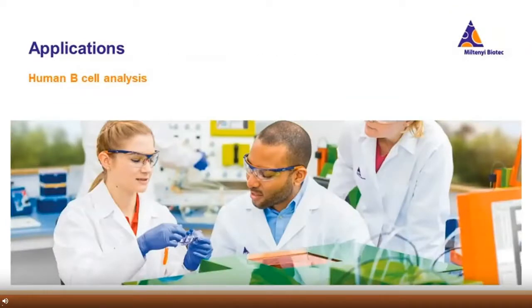Yeah, thank you, Urmi, for explaining this to us. And now we will go into the application section. I am going to show you some examples now, first for human B-cell analysis.